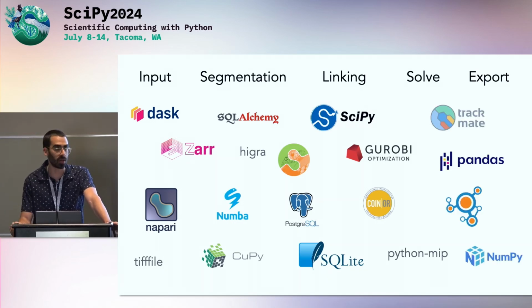And we are able to export to several formats: NetworkX, Pandas, and even TrackMate, which is in the Java world.